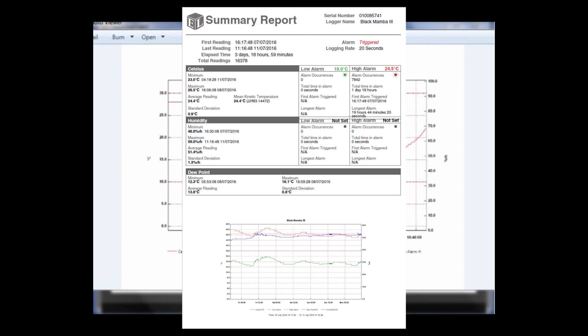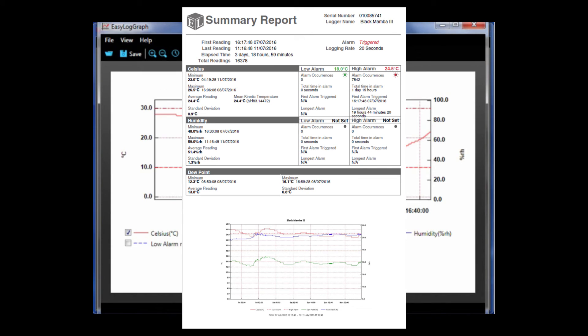Length of data logging session, total readings, and average readings for the session. This is a particularly useful tool when needing to show the highlights of any given session without sending the full graph of readings.